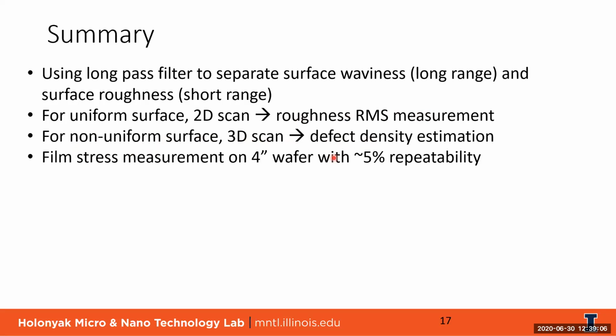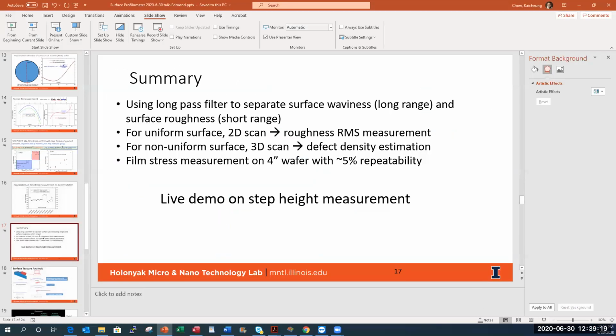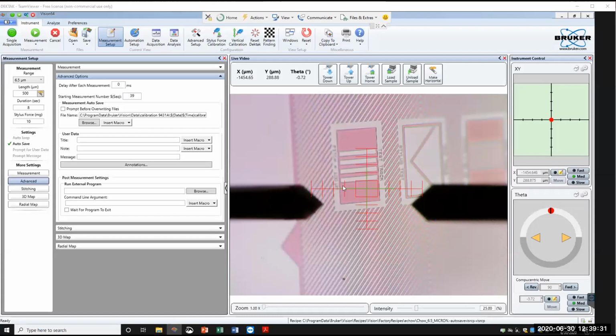And with that, I'm going to do a live demo. So let me stop sharing this screen and let me share another screen. Okay, I hope you can see what I'm showing here.